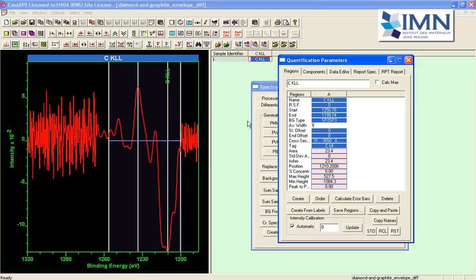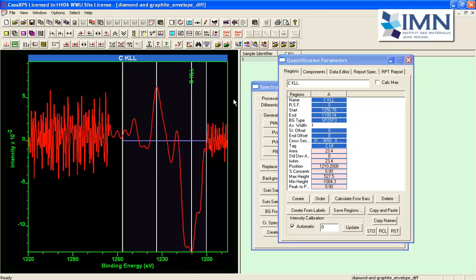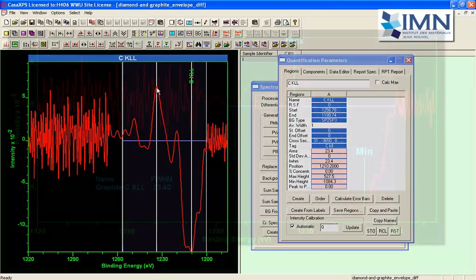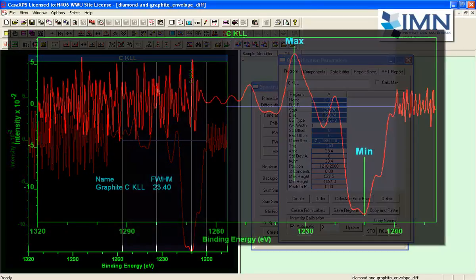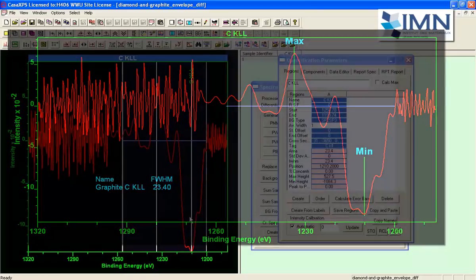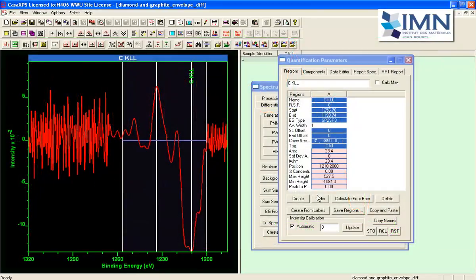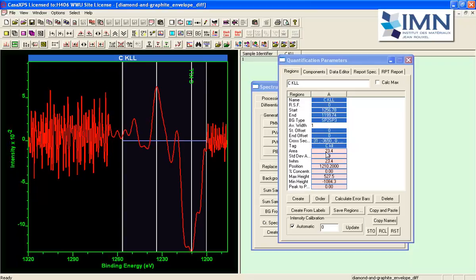And it will then indicate two points here at the largest maximum intensity there's the minimum intensity and the difference between these two lines will represent the D parameter and it's 23.4 so this is graphite.